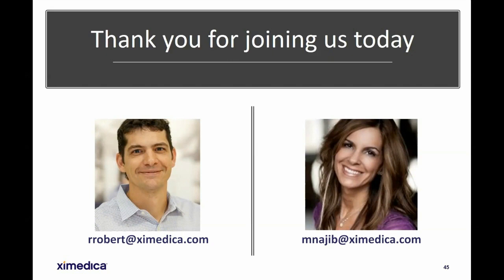Yeah, so I think in parallel with the evolution of both clinical diagnostics and molecular diagnostics, everything is moving towards automation. So in looking at automating library prep, it's the same benefits. You're looking at reduced cost per test. You're looking at decreased hands-on time, decreased variability, all of those same advantages of automating the library prep process.